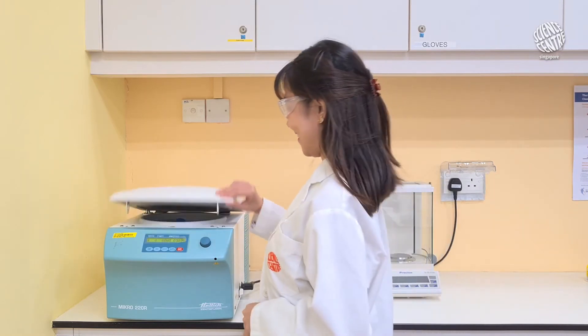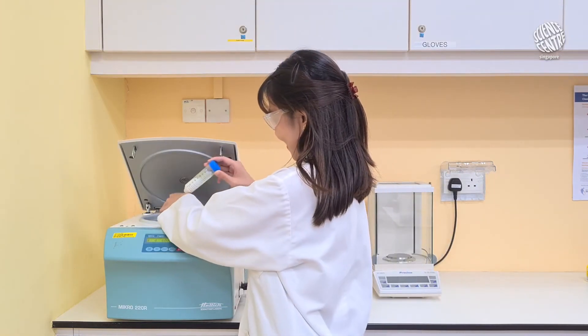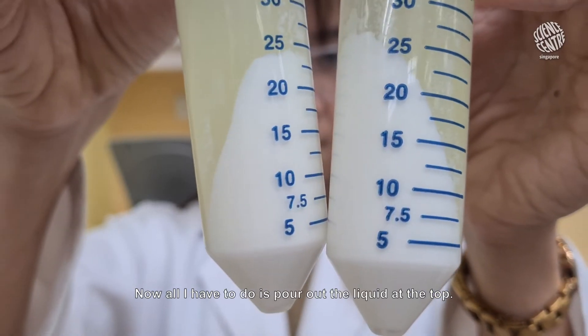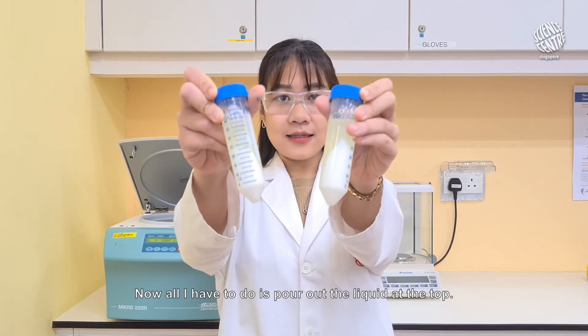It's done! See how the milk curds have collected at the bottom? Now all I have to do is pour out the liquid at the top.